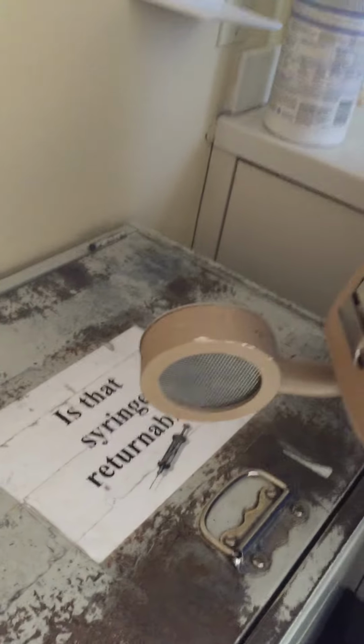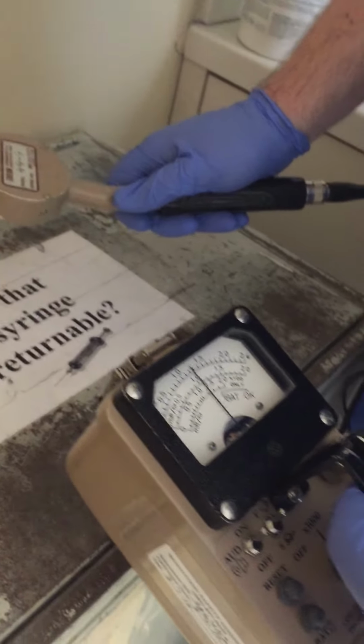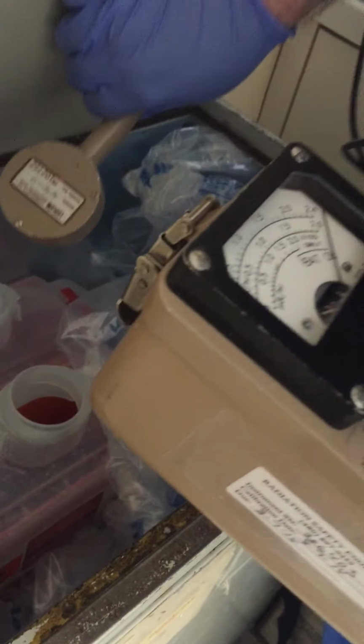So it's shielded. You can hear it's much quicker, much hotter. And if we were to open it, hear how loud it is? So that's very hot. So if you hear that, you know that there's contamination, or at least radioactive isotopes that are present. Yeah, radioisotopes.